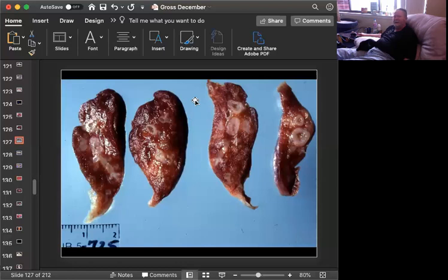It's not the same as it is in people, but if you remember all the way back to your vet school radiology, someone probably showed you a picture of these, and they said, look for donuts in the lungs of cats. And now we can see exactly what that is. And there's just tremendous smooth muscle. This is a disease that primarily affects the airways. And you have tremendous smooth muscle hyperplasia and submucosal gland hyperplasia causing these cuffs and outlining the airways. Feline asthma.